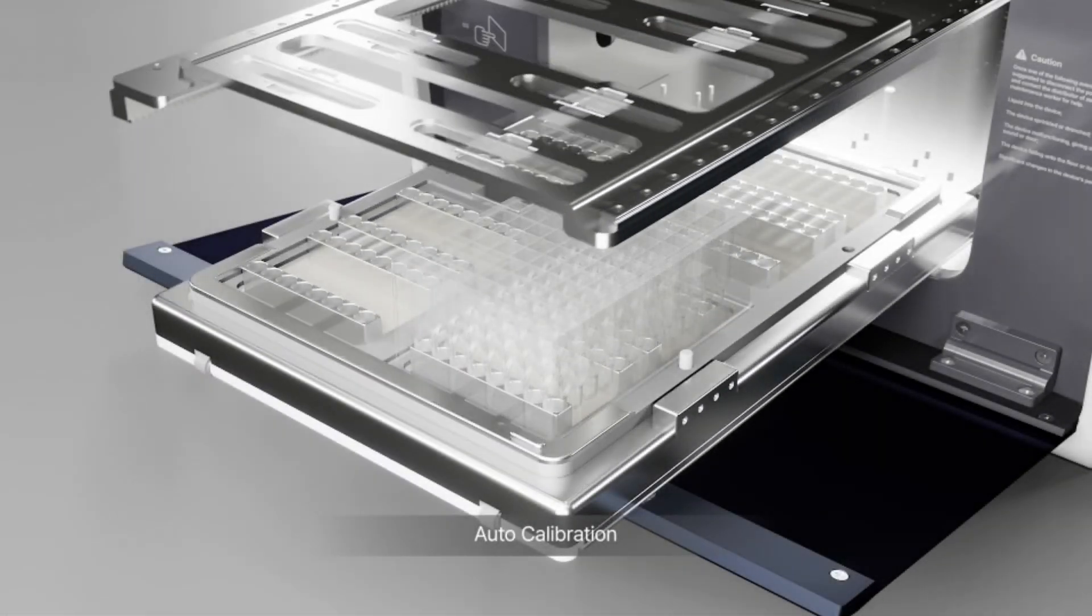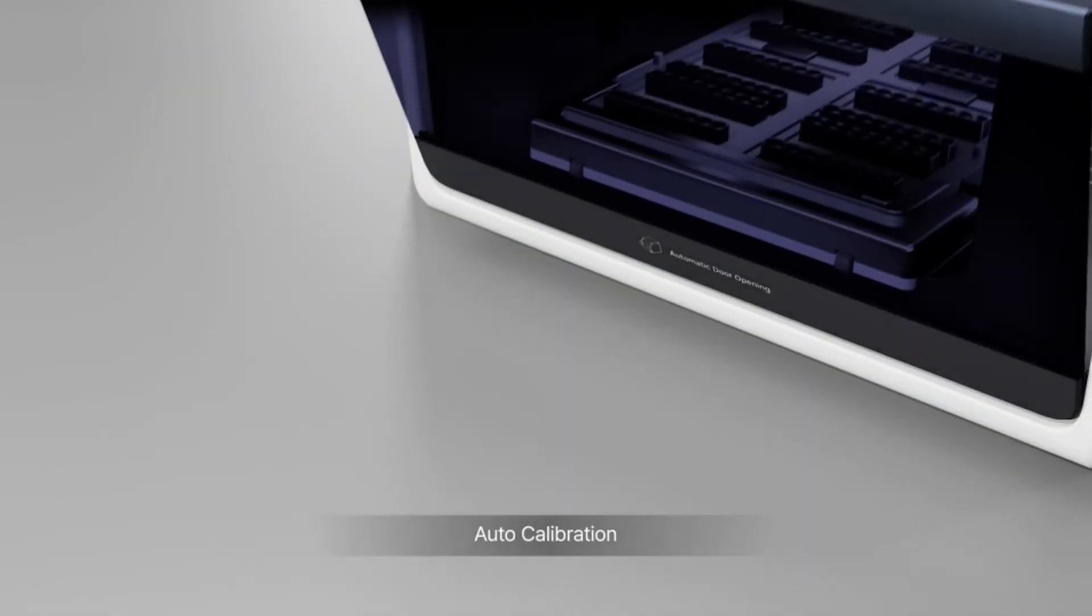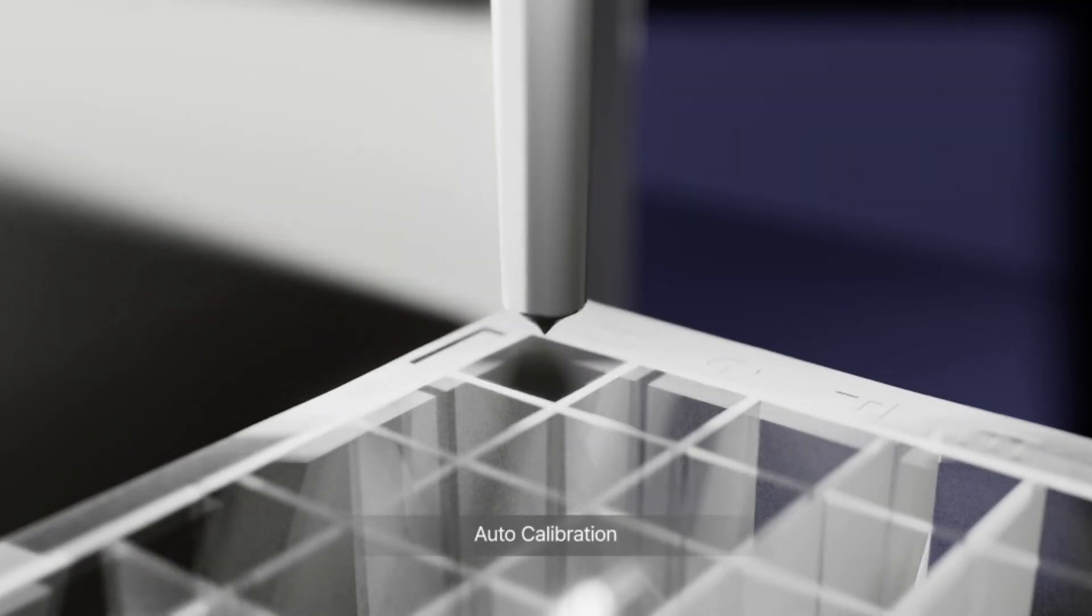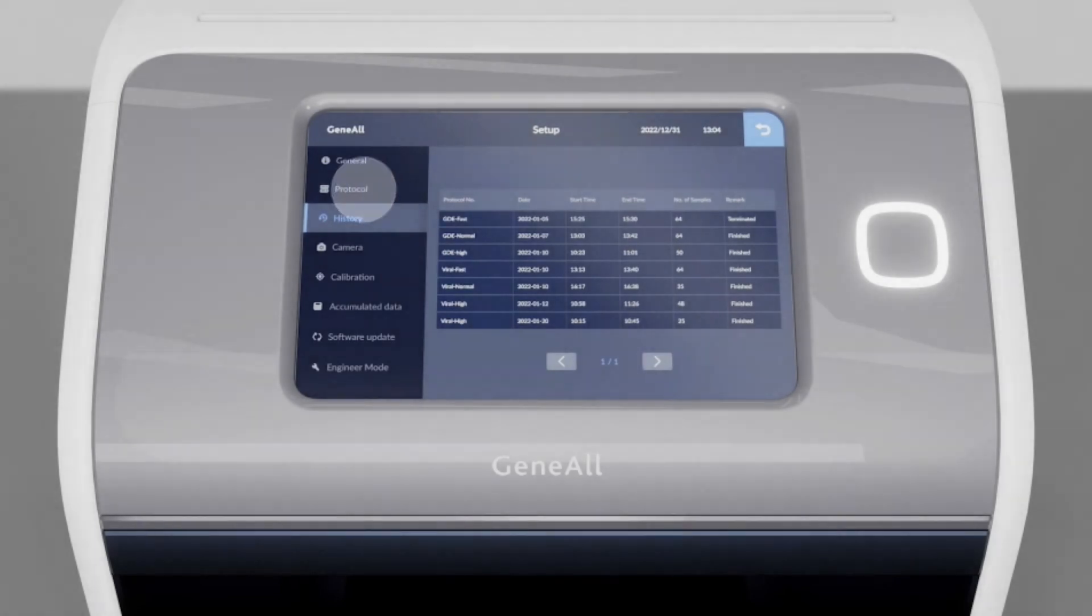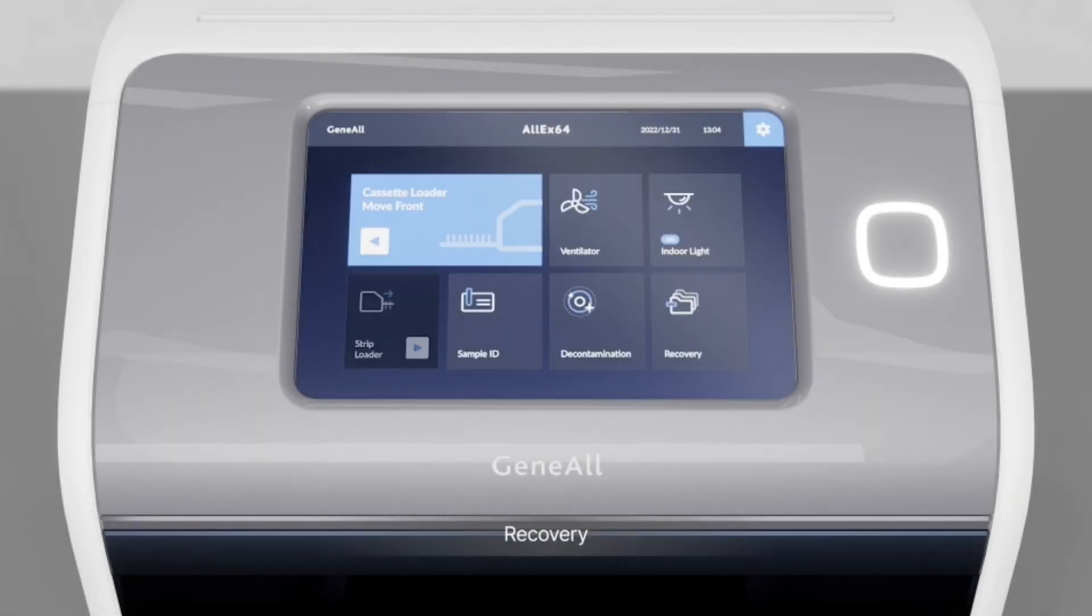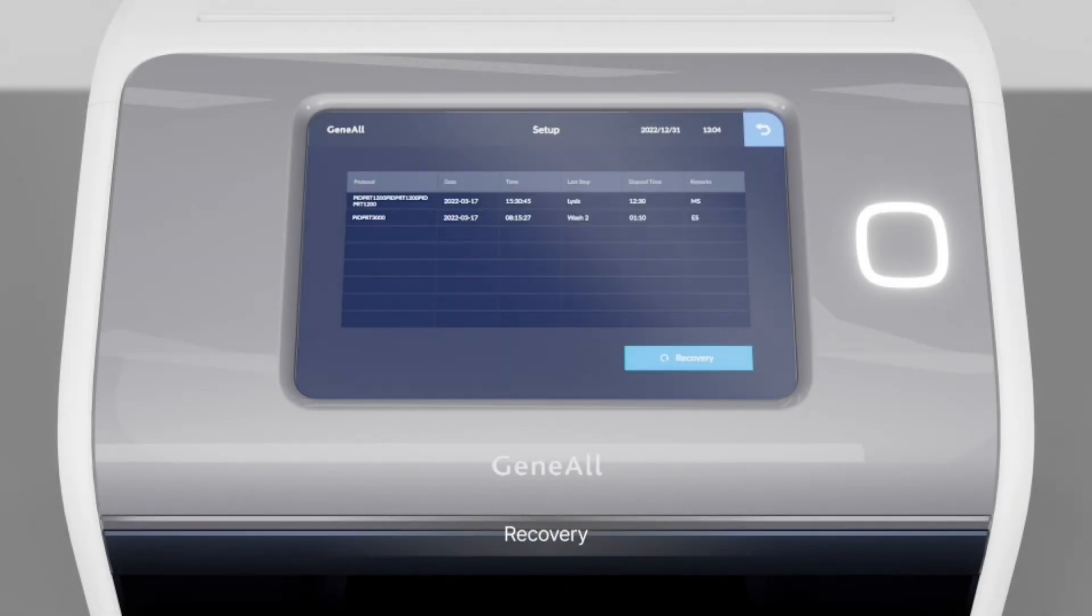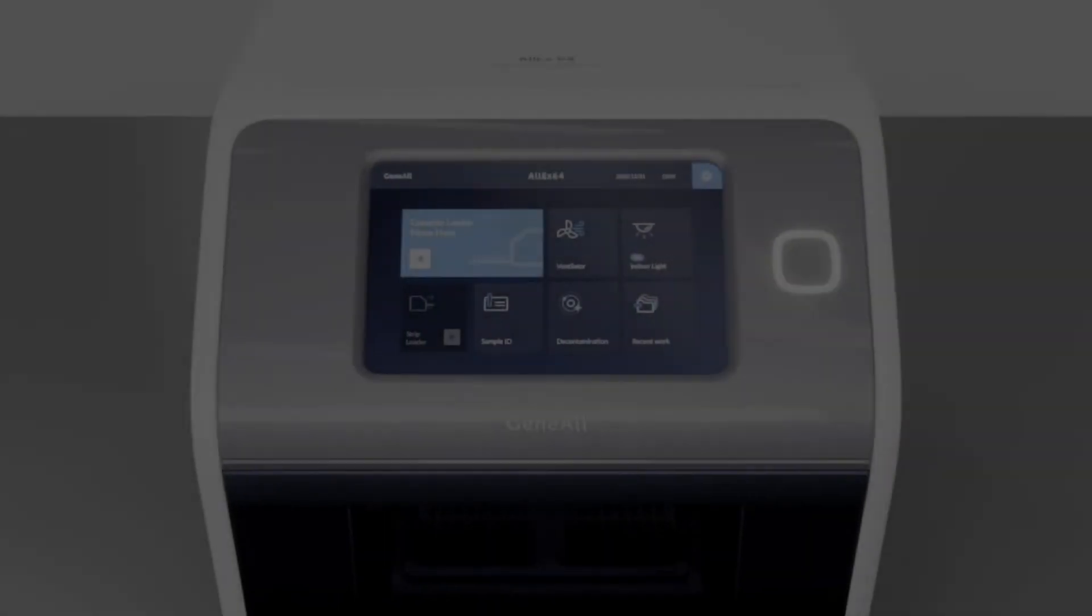Smart calibration tunes parameters automatically, significantly reducing the effort in engineering work and associated costs. Smart information hub provides complete run history and can resume runs from failed or interrupted steps to save precious time and samples.